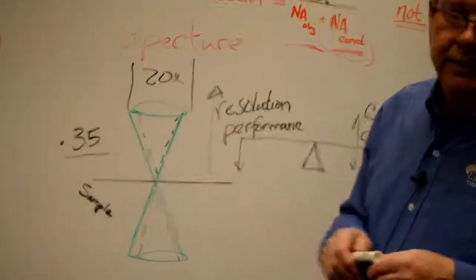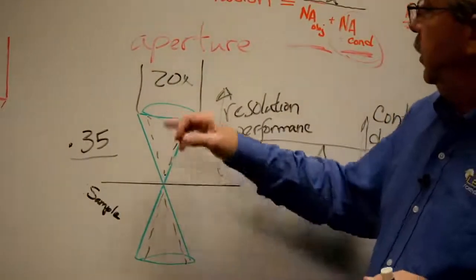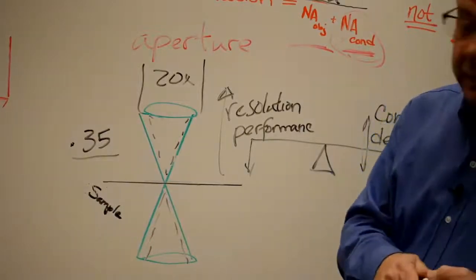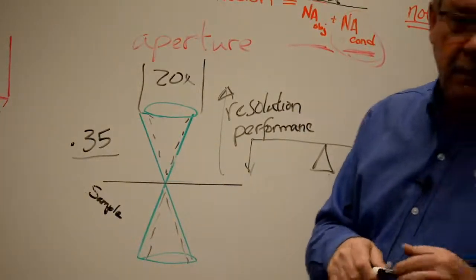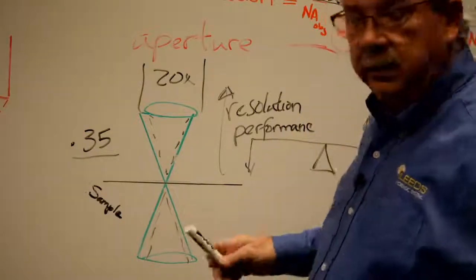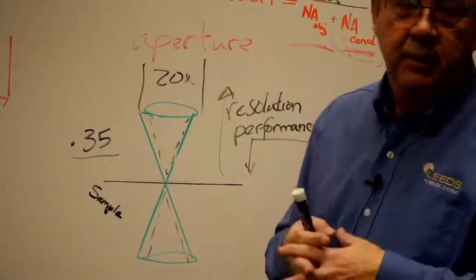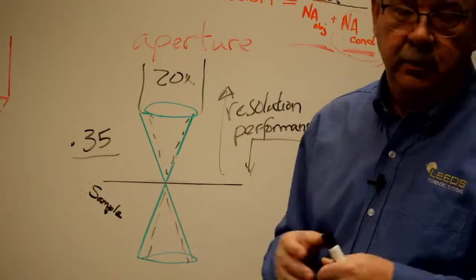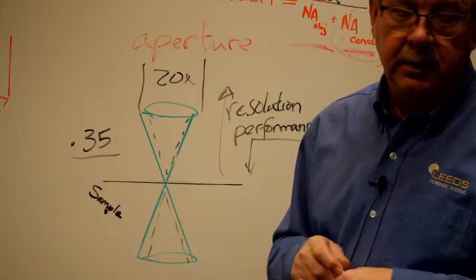If you've got one of our zoom macroscopes, your numerical apertures on that objective, while they're quite high, 0.15 for an instrument of that type, they don't need structured light coming from them. That's why we don't require a condenser when we're using a low power system like that.